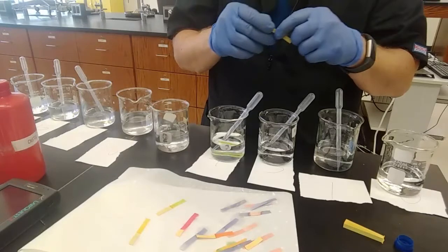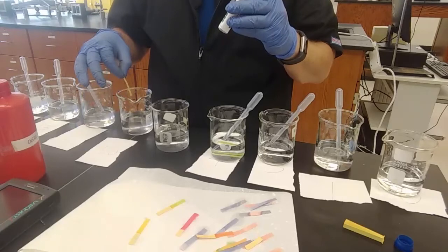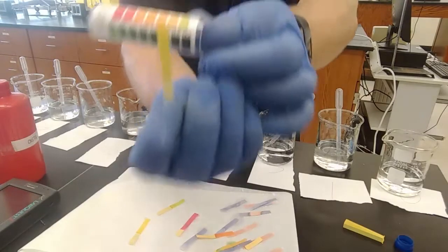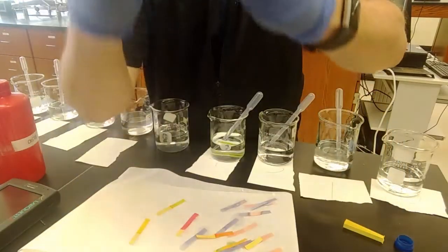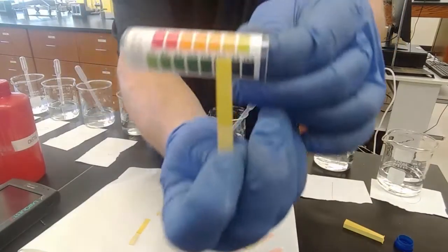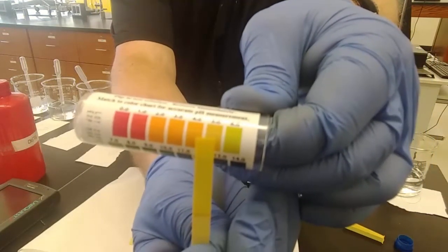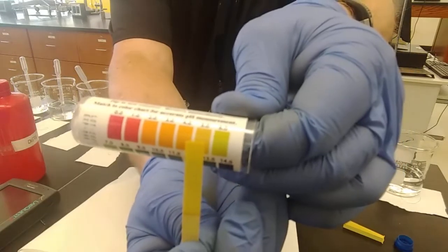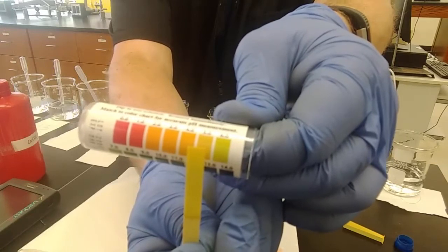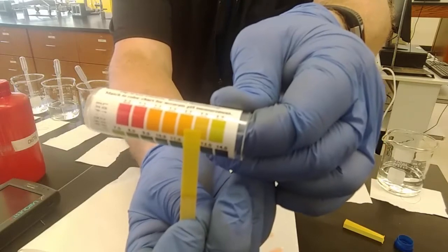The litmus paper didn't change, either one, so that kind of indicates a 7, or not acidic, but we know it's acidic. So, all right, expecting a 10. Nope. If anything, it's even lower than a 6. I think that the 10 is a 5, based on this universal indicator. Well, we knew it was acidic based on the meter, and the litmus paper was unchanged and inconclusive, but this universal pH strip seems to say that it's pH 5, lower than our deionized water, which is weird.